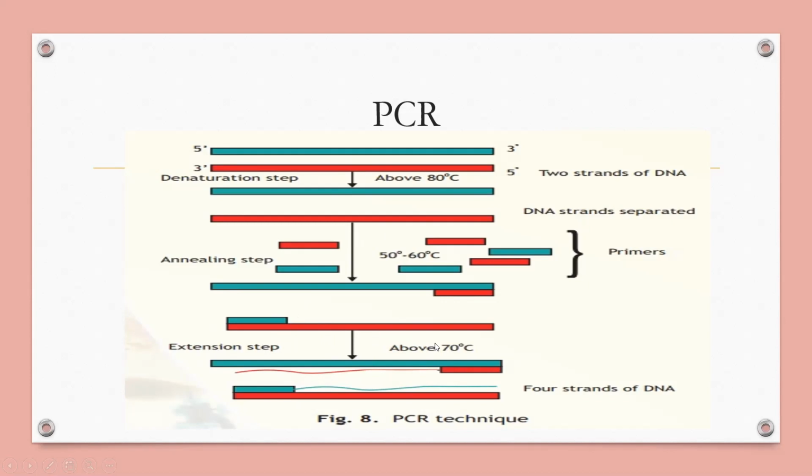Extension or synthesis. The initiation of DNA synthesis occurs at the 3' hydroxyl end of each primer. The primers are extended. Look at here. This is primers. These primers are extended by joining the bases complementary to the DNA strands.